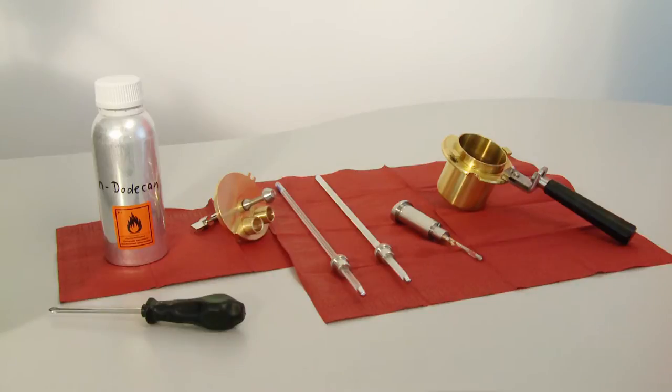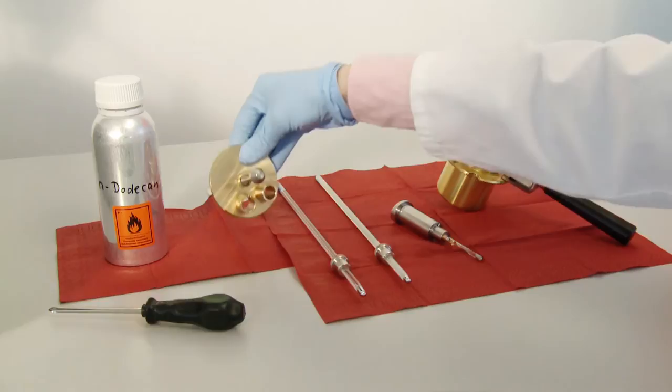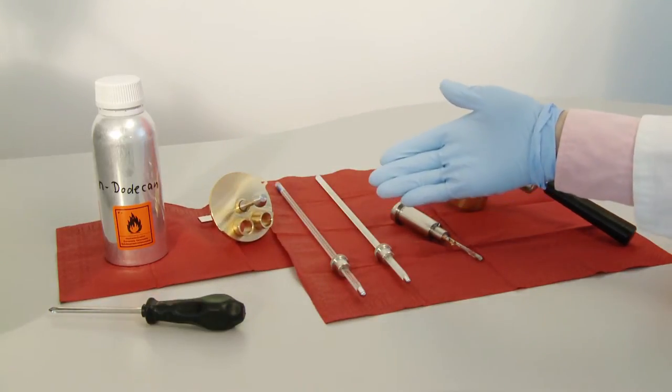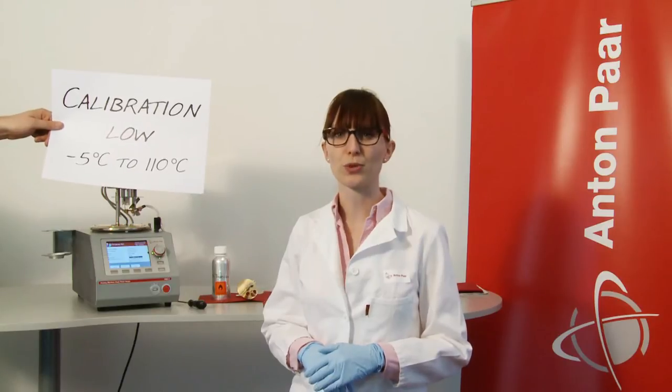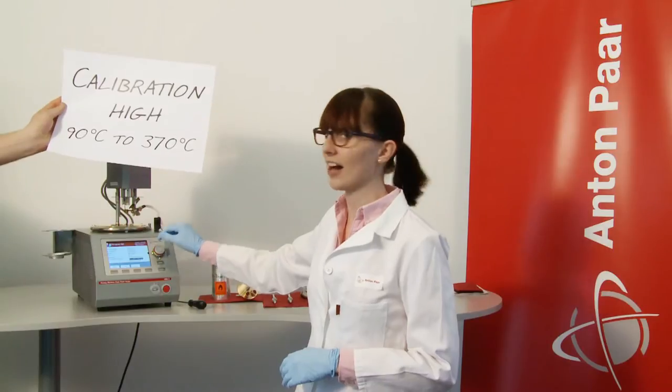Here is the calibration set you need: a calibration lid and two certified thermometers. The thermometers have two different temperature ranges, so you can choose one depending on your testing needs. Then you select the according calibration program, either calibration low or calibration high.